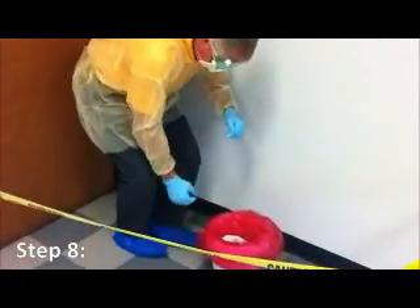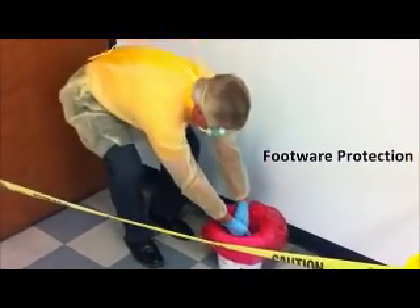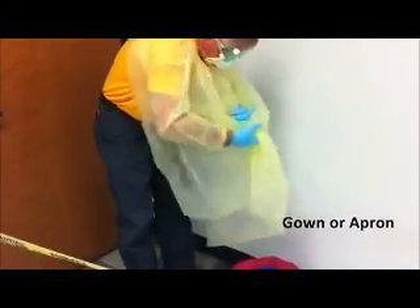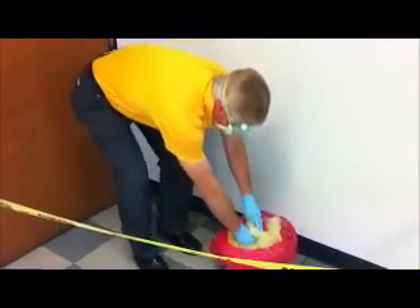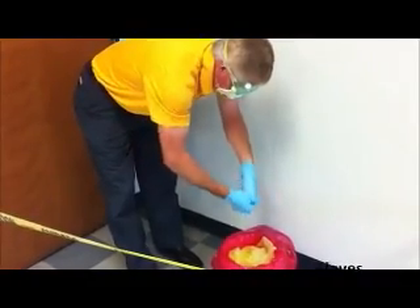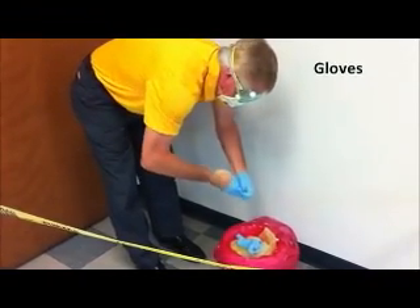Step 8. Once the area has been cleaned, remove your personal protection equipment by first removing your footwear protection and placing them into the lined bucket. Next, remove your gown or apron, rolling the sleeves from the shoulders to your wrists and placing them into the lined bucket. Remove your gloves by carefully pulling the area from your wrist toward the fingers, rolling them inside themselves and placing them into the lined bucket.